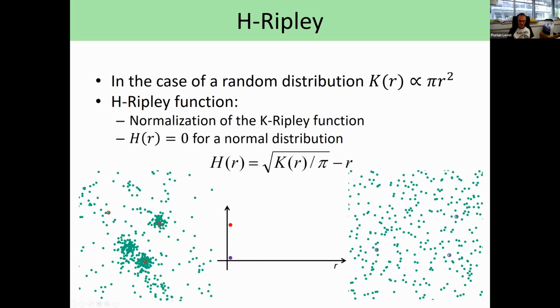You begin with a small radius, and you compute the number of localizations inside this radius for each of the localizations in the dataset. Basically, that means that you compute a density value inside this radius R, and you will see that you have a higher value for clustered data than for random data. So you have really here for this one, it's higher.